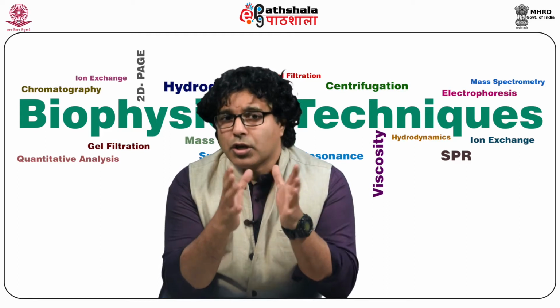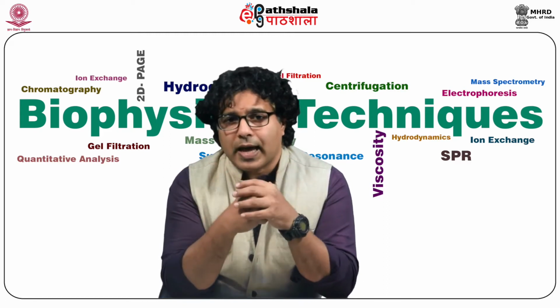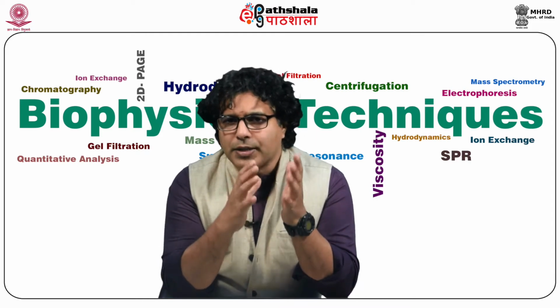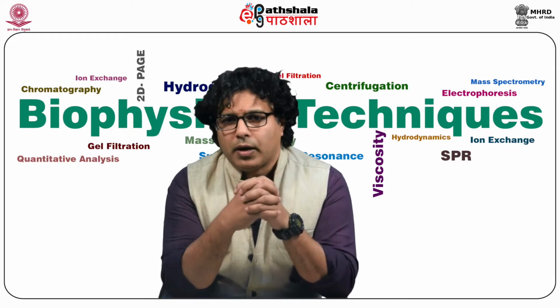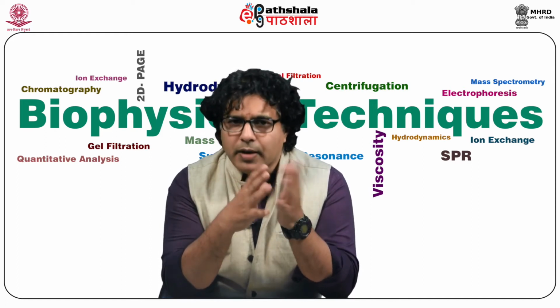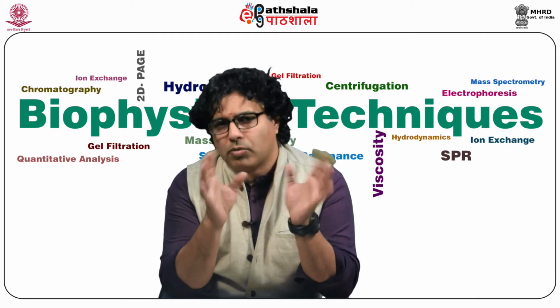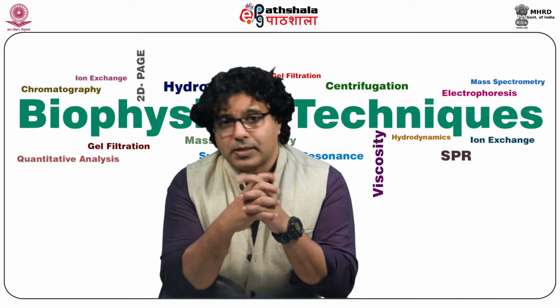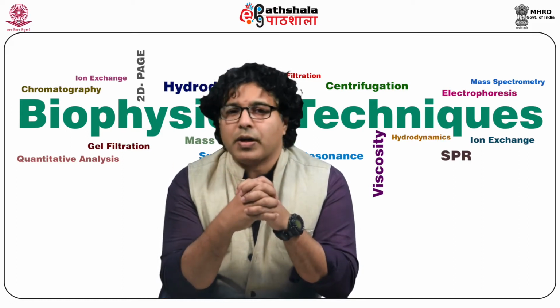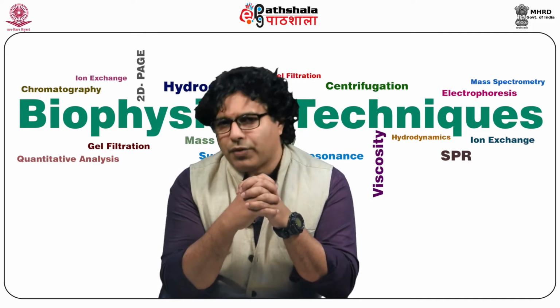Similarly, neutral loss or gain can be seen in the scanning mode, where fragmentation leads to the loss or gain of a neutral. This gives complete qualitative information about the molecular structure. Time delayed fragmentation experiment is another type of experiment, which we call MS to the power n. This is used for structural elucidation of a compound.